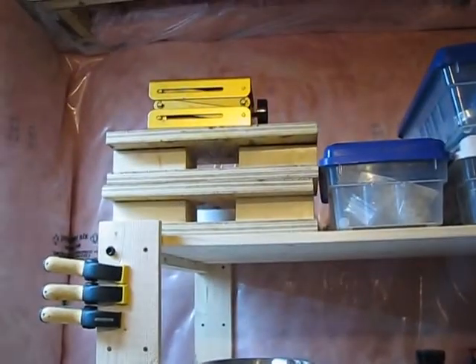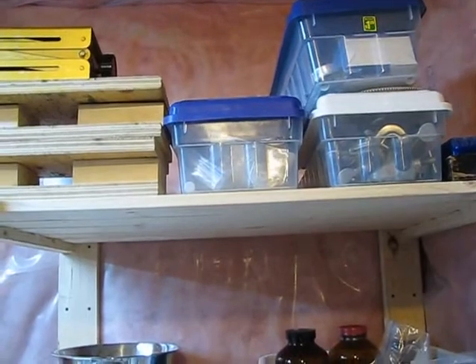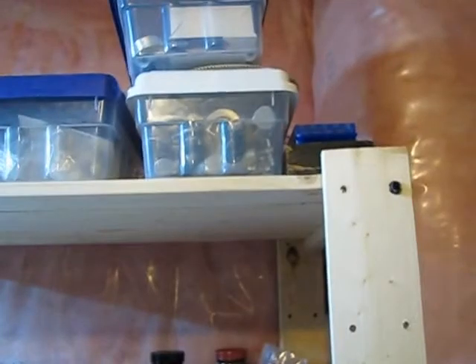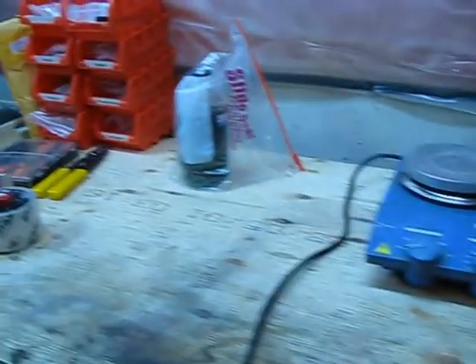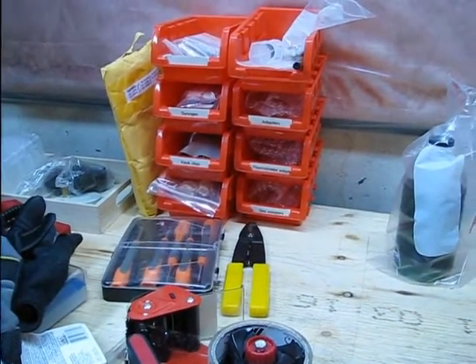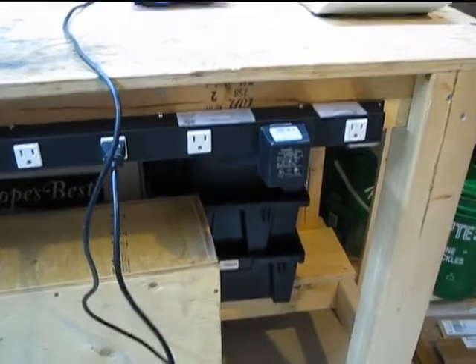On the very top we have parts for stands, a labjack, test tubes, pipette bulbs, clamps, filter paper, labels, tube racks. Then on the bench we have a balance, hot plate, bins for things like adapters, stoppers, and pH test paper, and the newly installed power bar, which should be nice to quickly plug in new devices on the lab bench or just as a general workbench.